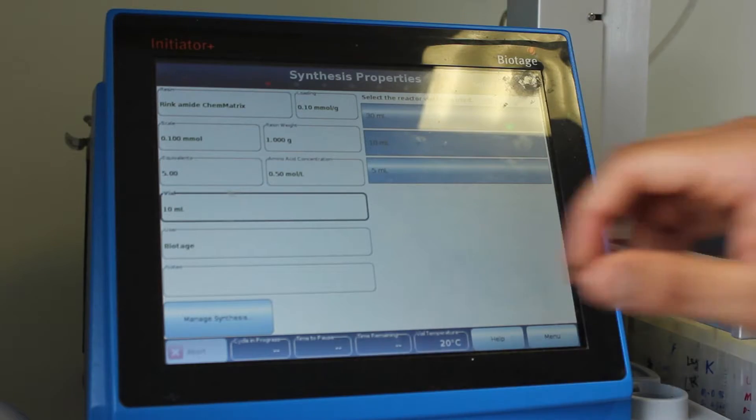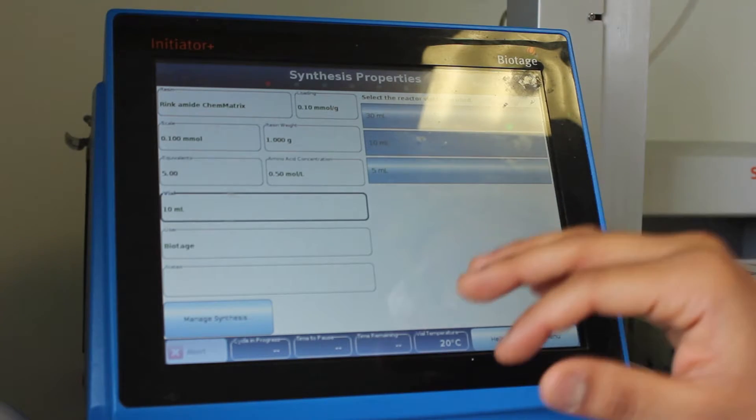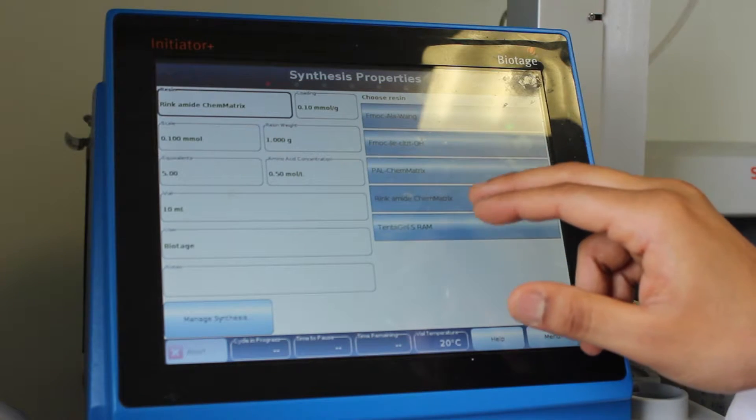And you can make different combinations of peptide sequences. And this is an automated peptide synthesizer which does the job for you.